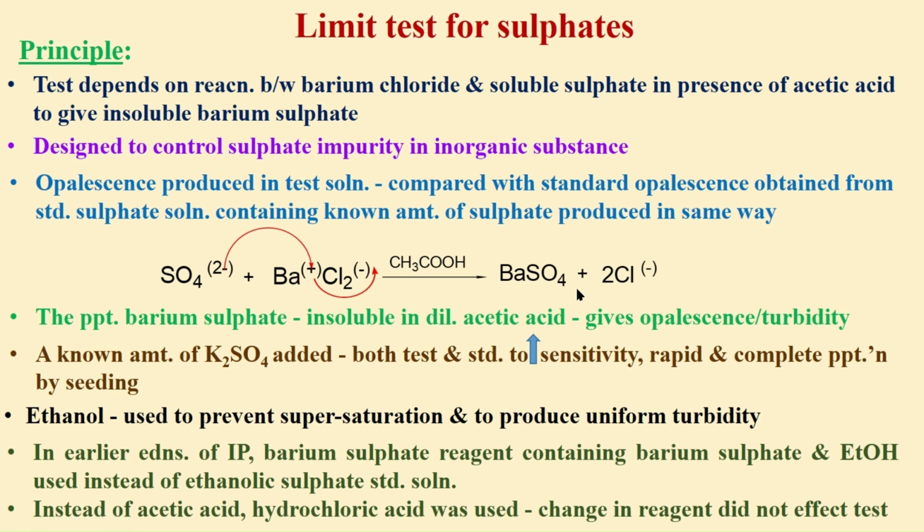In the earlier pharmacopoeias, barium sulfate reagent containing barium sulfate and ethanol was used instead of ethanolic sulfate standard solution. We are adding potassium sulfate, right? Here barium sulfate was used. Here potassium sulfate has been used.